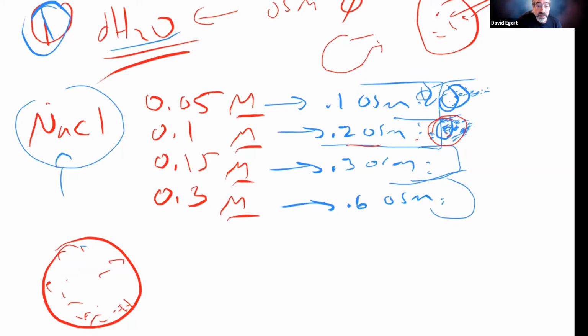I can say just from having done this same experiment for over 20 years now, we used to do the experiment with blood that was expired from a blood bank. We would get it right after it expired, and I can say that the blood was always lysed in this situation.